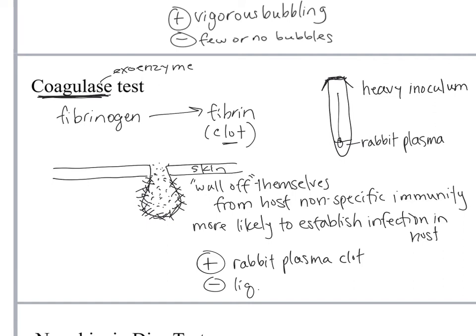You want to make sure that you put that foil back on after you inoculate it, because there's so little volume here that a lot of it would evaporate away in the incubator. So make sure that foil is back on there to keep that from evaporating. And again, as long as you get a heavy enough inoculum, this works really well.